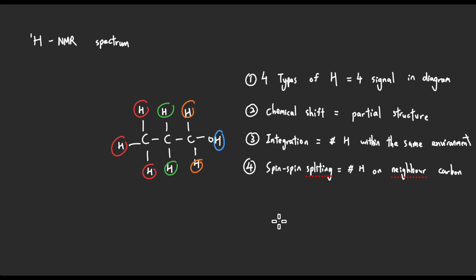There are some special things that I want you to keep in mind. The first one is, if this one is not considered a neighbor, because a neighbor should consist of a different carbon. This structure could possibly become a neighbor, but if their structures look identical, then it's not considered a neighbor.